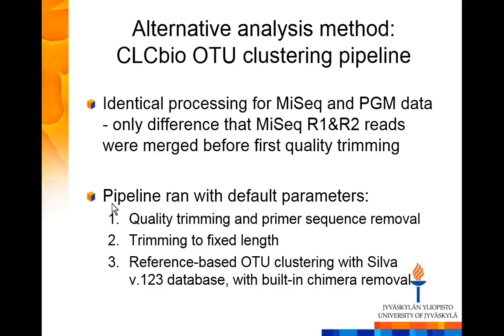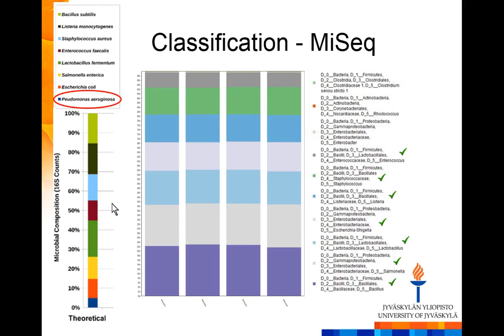For MiSeq, I think even less. Sometimes you lose 90%, so not that much now. I actually wrote all these down, what I lost in which step with my protocol or with the commands. So I can give you that, and there you see all the data.